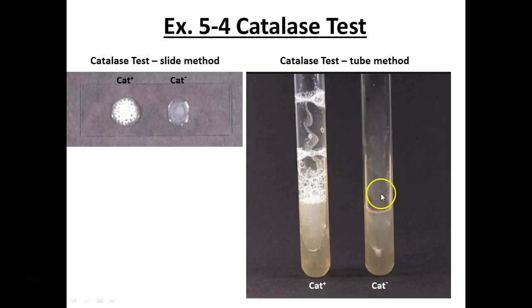So we're going to actually put it right on the slant, after we do the slide test. You do have a slant. You did label catalase, but it's quite old, right? And especially for those of you guys that know you have spore formers, that might create a problem. You might not actually see any bubbling. So you'll notice that you have a fresh culture that I made for you guys yesterday if your organism was grown at 30 degrees, which are the two back tables. You'll see that there's one that was dated yesterday with a little circle and your number. And you can use that one, and I would suggest using that one definitely for your slide test, and you can even use it for your slant test.